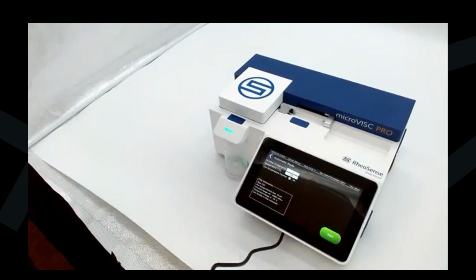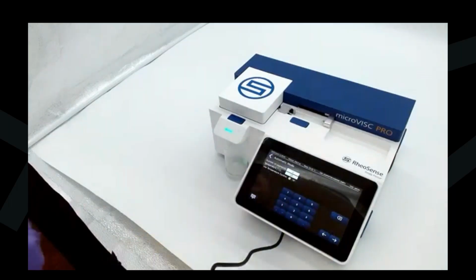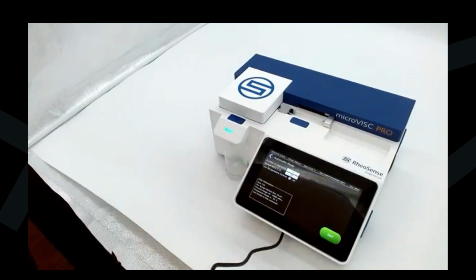Here it's asking us to enter how many segments or repeats or measurements that we want. It looks like we've already got about that many measurements, which is good. For temperature, we're going to leave it at room temperature. On the bottom left, you can see the chip information if you're interested.